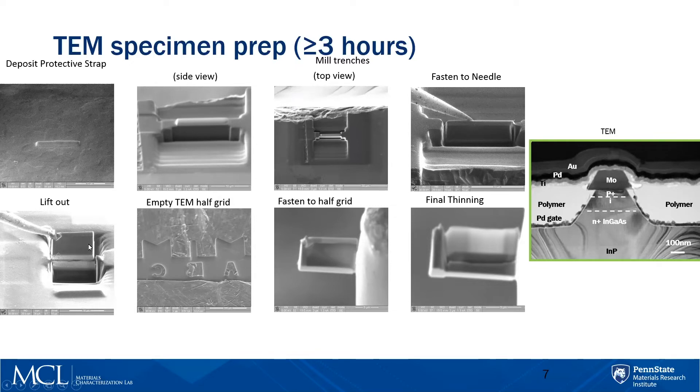It's 10 microns from here to here, which is too small to handle by hand, so we put it on something larger — half of a copper disk that's been machined in this shape, held in the jaws of a vise, and it's three millimeters across, which we can handle. This membrane is the bright spot you see here. We deposit material to fasten the membrane to the post, cut off the needle, and then use the ion beam from the top, front, and back to make the sample thinner. When it appears bright, it's thin enough to answer those questions: is it crystalline, is it amorphous, what's the chemical state, where are the elements?